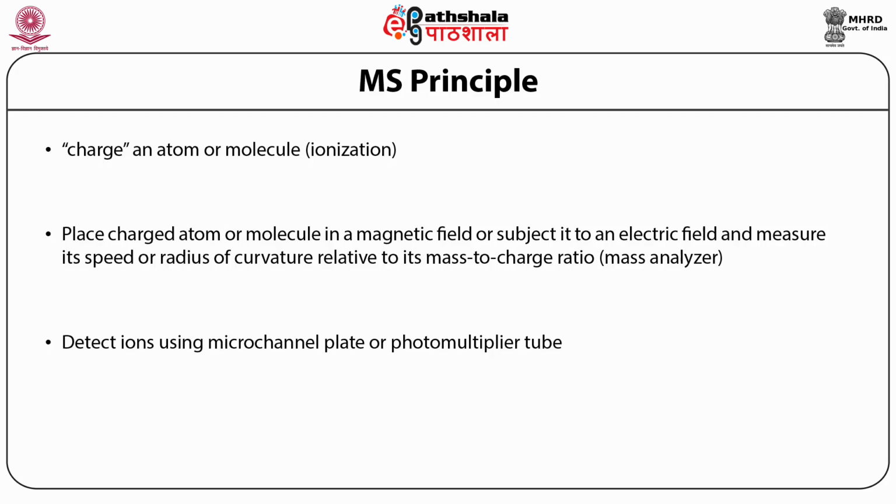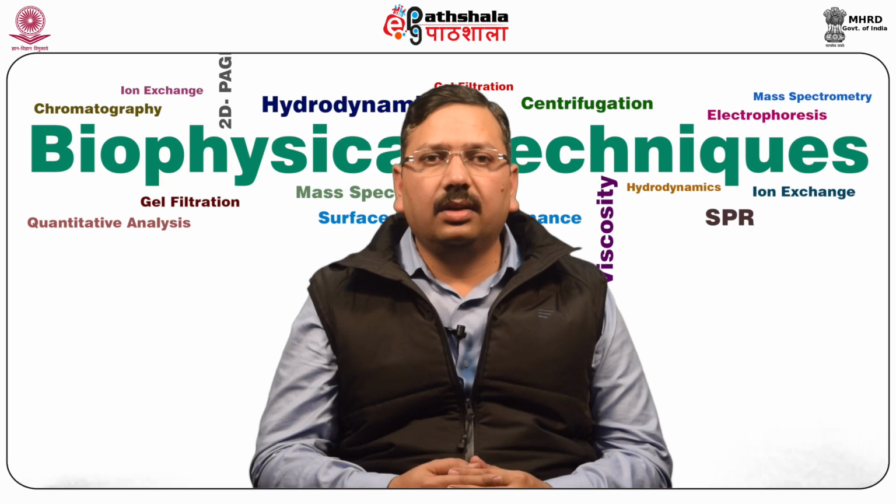The resulting mass spectrum is displayed in the form of a plot of ion abundances versus mass-to-charge ratio. Thus, the structure and nature of the precursor molecule is elucidated. The separated ions are detected, and this signal is sent to the data system, where m/z ratios are stored together with the relative abundances for presentation in the format of an m/z spectrum.